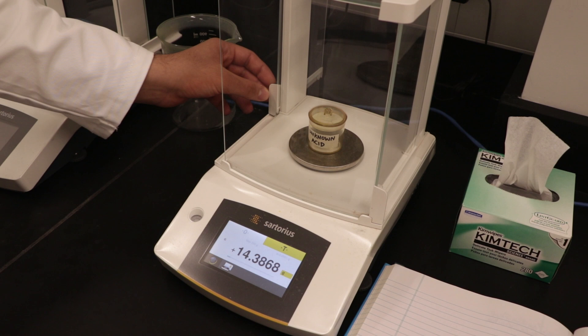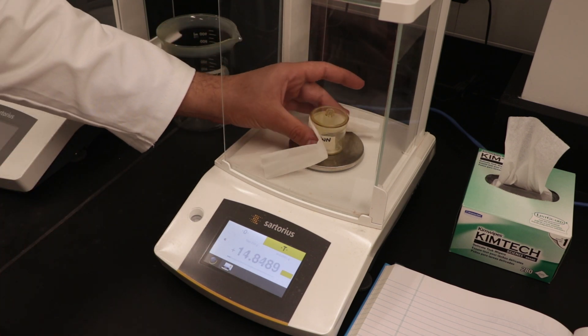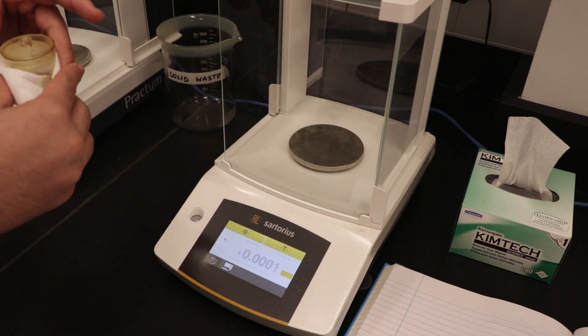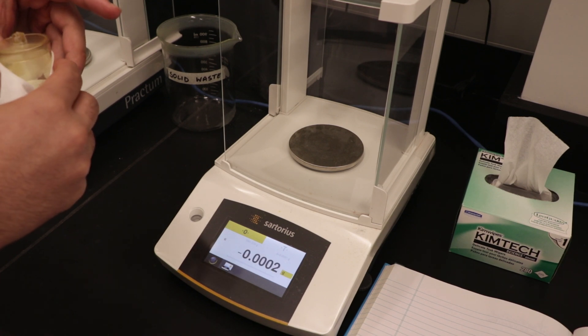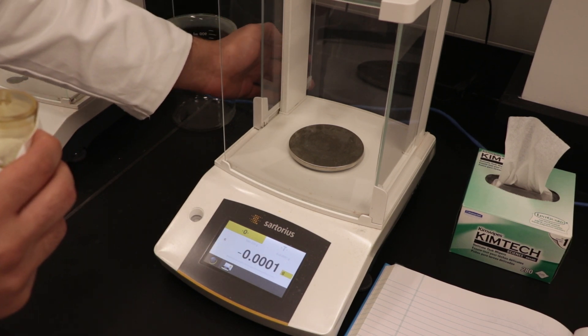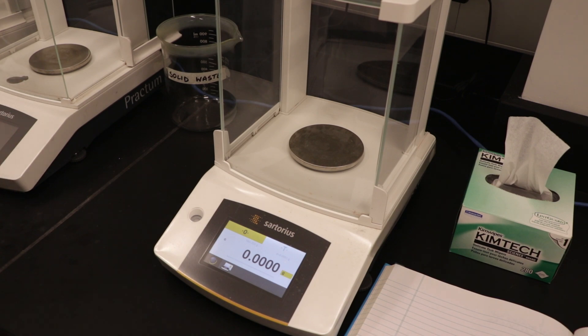Next, using a Kim Wipe, which can be found by the balances, carefully remove the weighing bottle. It is important to avoid direct contact with the weighing bottle at this point to prevent the transfer of any oils from your hand onto the bottle.